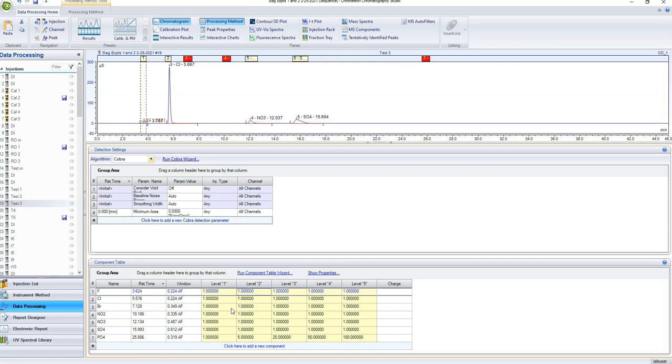It's really easy to ruin other people's data, instrument methods, and processing methods if you start clicking around in their stuff without knowing what you're doing. And sometimes even if you're clicking around in your own stuff, you can mess up a lot of things on the instrument. So be really careful and make sure that you've double checked with people who know what they're doing before you start messing around with the IC too much.